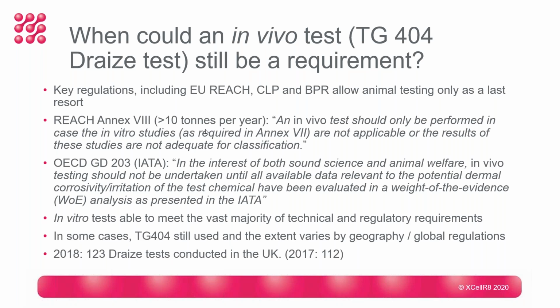We're not able to distinguish between the eye and the skin Draize in those figures because we don't have that level of detail. And I think that it's just important to really drill down into the detail of the in vitro tests to understand what they can provide, just to help minimise those times when an animal test is still required. So next slide.